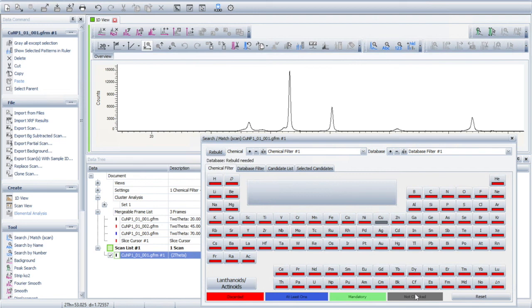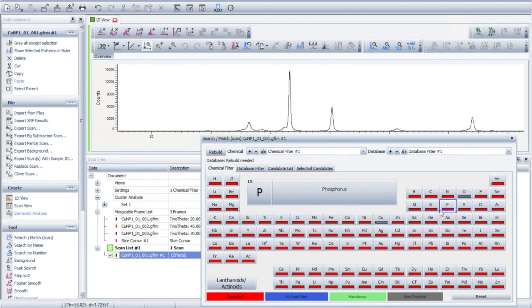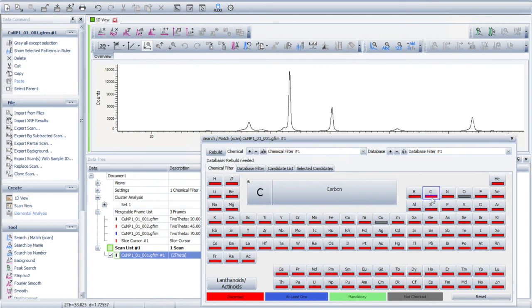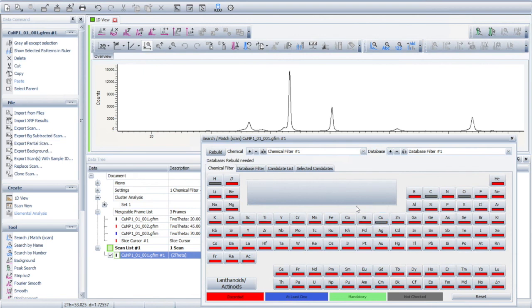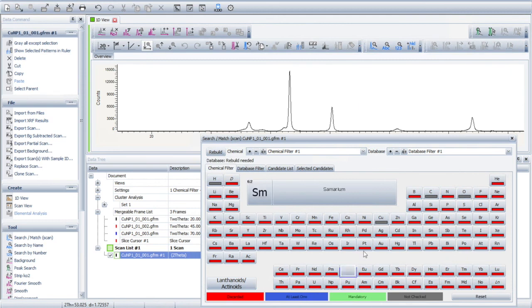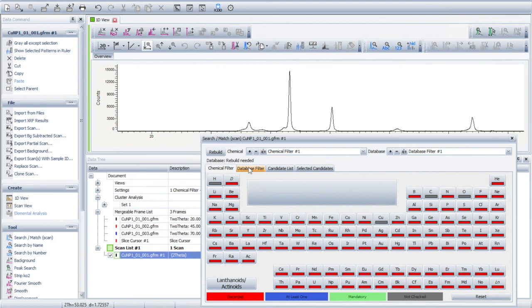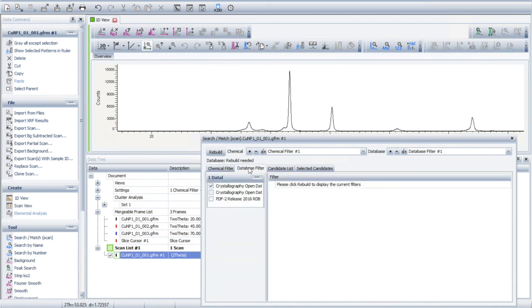So, this gray means neutral. So, it's maybe possible to exist. And, you know, we could put carbon because we did the XPS and we saw carbon. But, probably, these are not really carbide. But, you know, you can put the hydrogen in there just in case these things, organic something in there. And since I don't see anything using XPS, I'm not gonna select anything. Otherwise, you can select the whole thing and then they say at least one of these. So, blue here, blue here. And then you can actually do the search. But, go to the database.